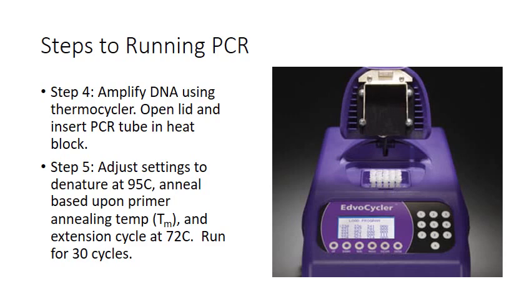You just put the PCR tubes inside, close the lid, hit the button, and you're good to go. This is going to make lots of copies, or amplify your DNA, and you're going to get lots and lots of copies of that target DNA sequence, just that piece of DNA that's in between those primers, and we call that piece of DNA in between those primers the amplicon. Sounds like something off of Transformers, right? Amplicon.